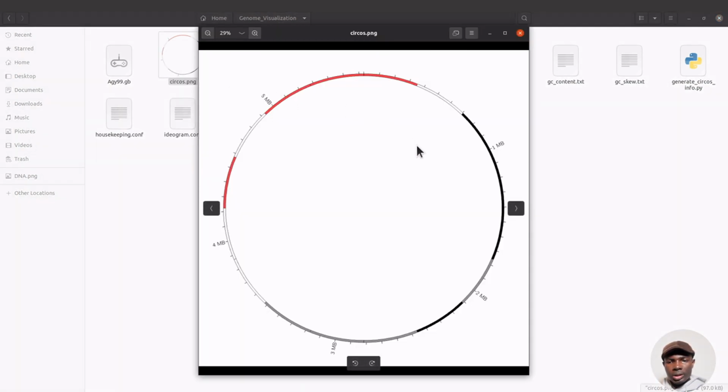So this is our new image. Notice how the labels have been done nicely for us. That's what we want. You can always experiment and customize. This is just to get you started. You can give any interval that you want. So let's continue. We have our bands, we have our labels, and you can also see some sections and some units, or whatever you want to call it, like some subdivisions. And then we have our Mb labels. So this is for stage 2.